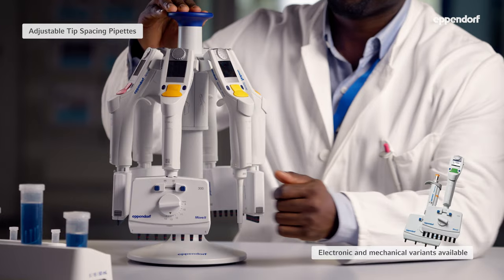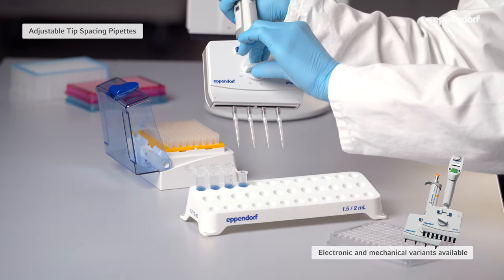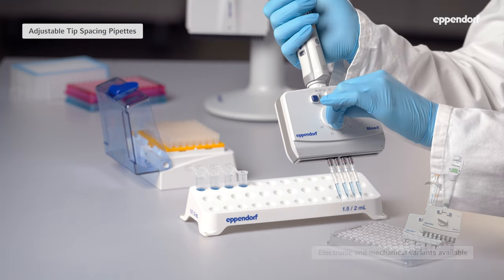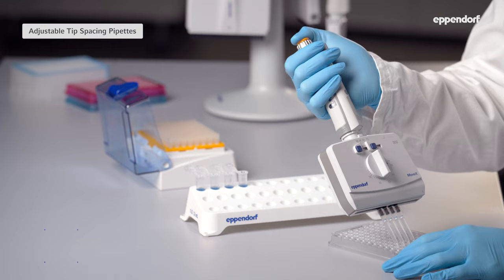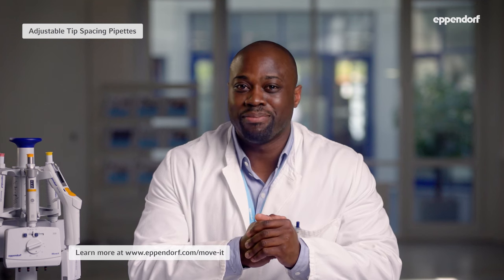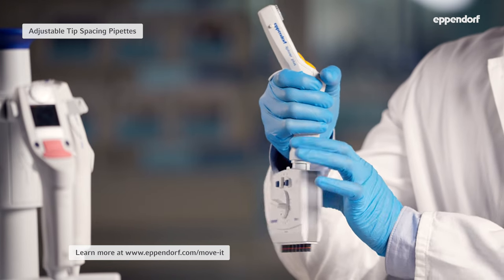Adjustable tip spacing pipettes. Sometimes you need to move multiple samples from tubes, and here an adjustable tip spacing pipette like the Eppendorf Move-It is helpful. With the Move-It pipette, you can easily change the distance between tips to match the different spacings between the tubes and the wells in the plate. Even better, the Move-It pipette is autoclavable and its head can be turned 360 degrees so you can always choose a comfortable working position.